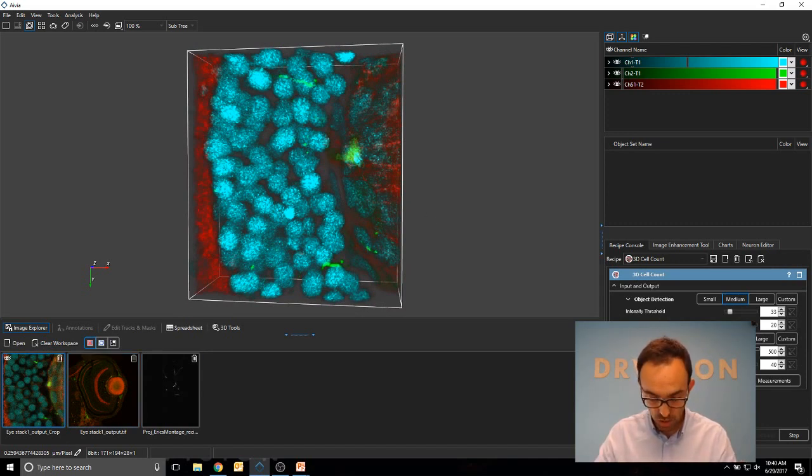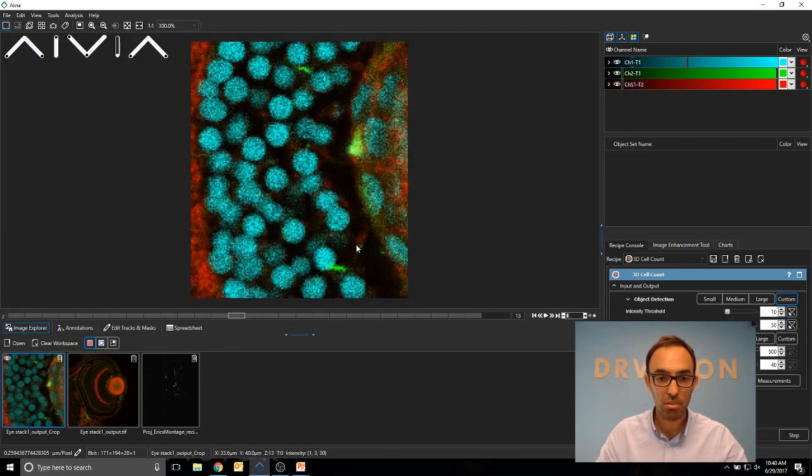And if I set here the parameters, so intensity threshold, I'll set it to 10. And again, I can measure this using the plane view. I can use the cursor and it tells me the intensity measurement down at the bottom here. You will see that there is 2, 33, and 44 that relates to the intensity at that location for channel 1, 2, and 3.